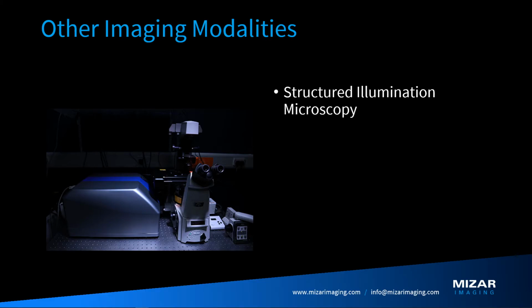Again, because these require a lot of light and multiple images to get a single image, structured illumination microscopy is not very well suited for live cell imaging, with quite a bit of bleaching and quite a bit of toxicity.